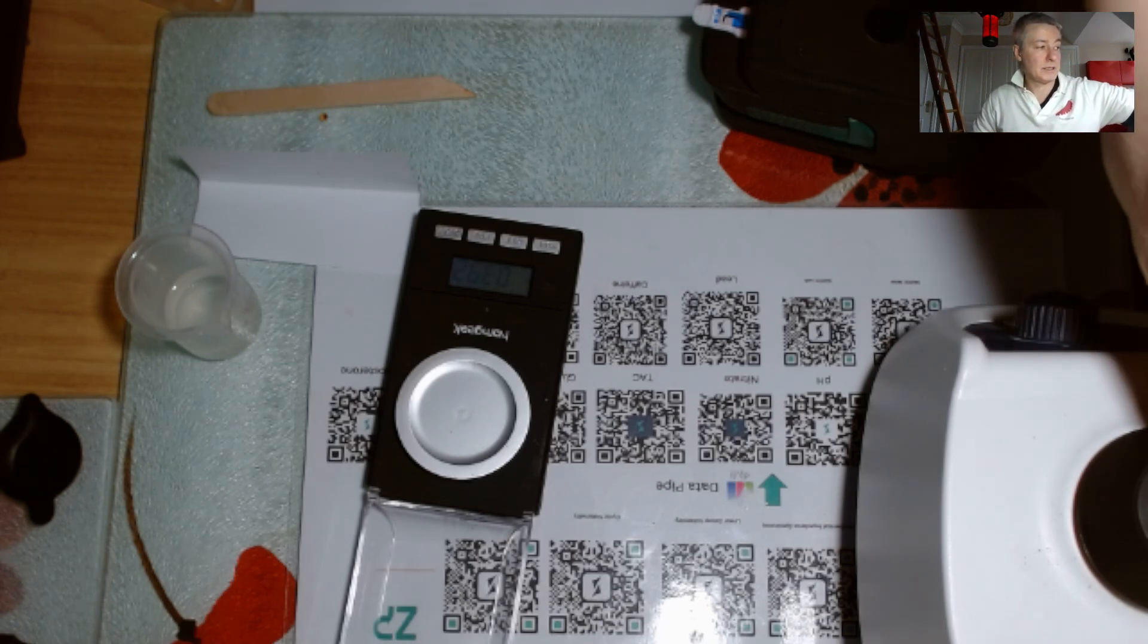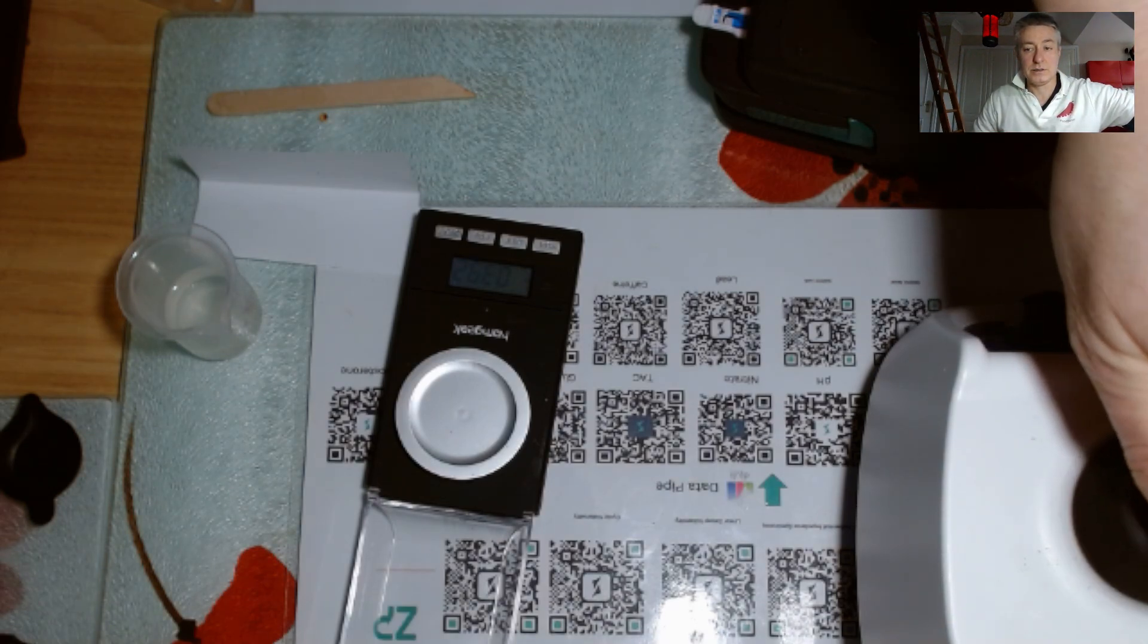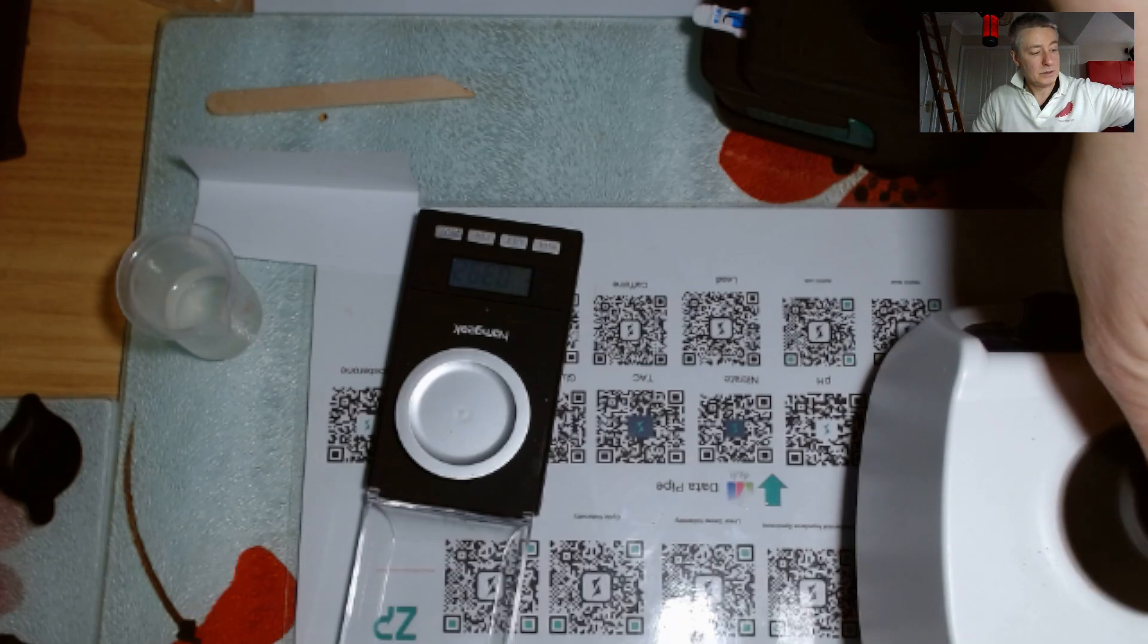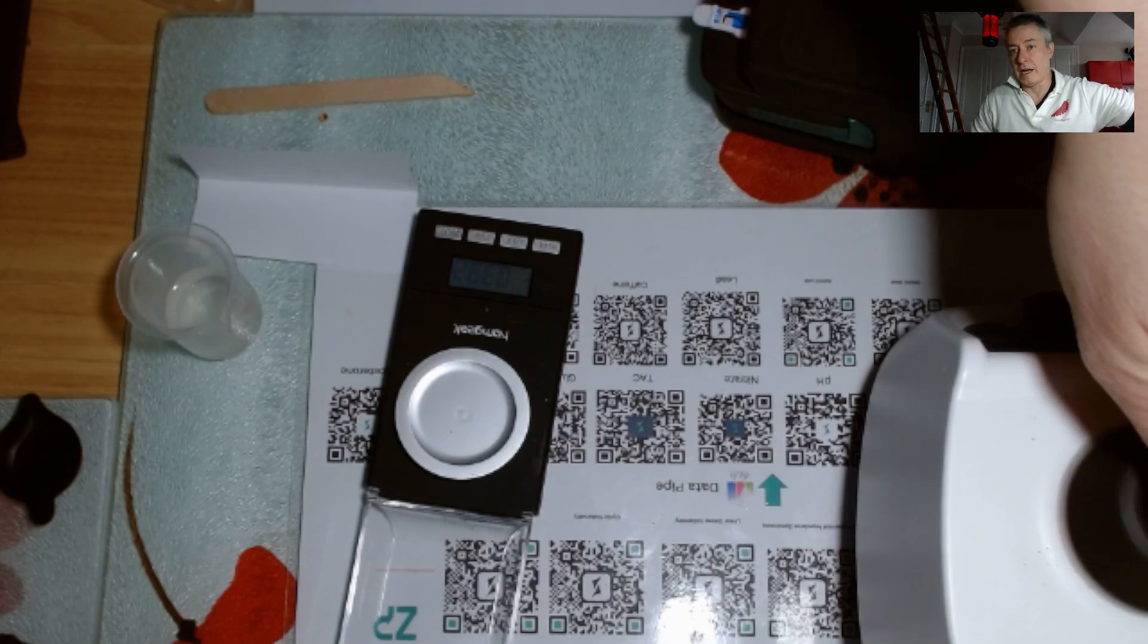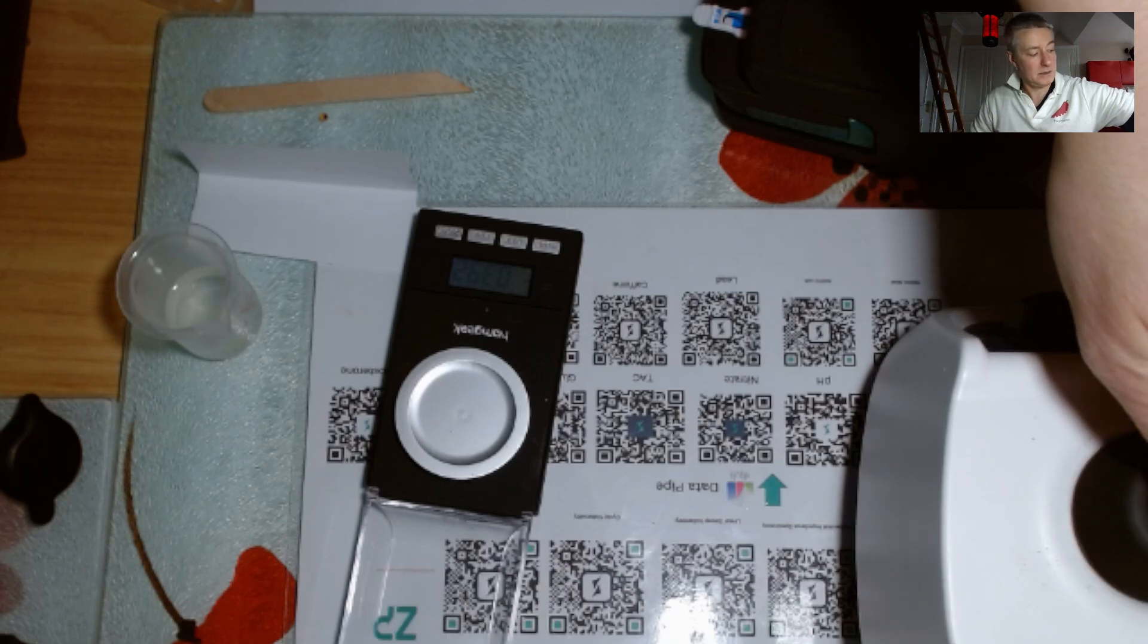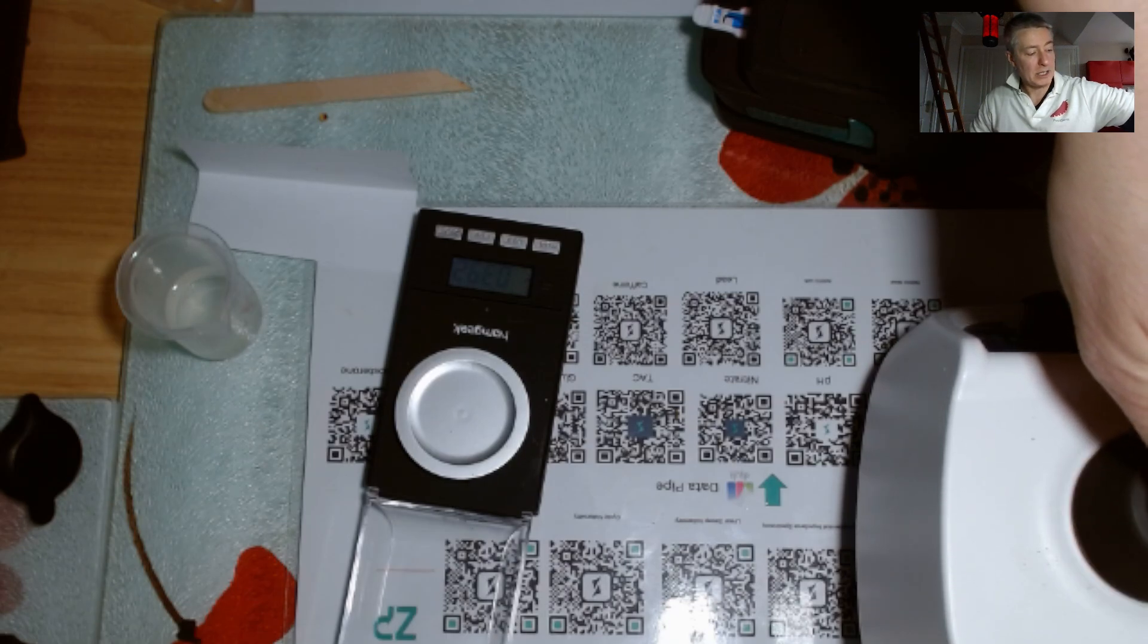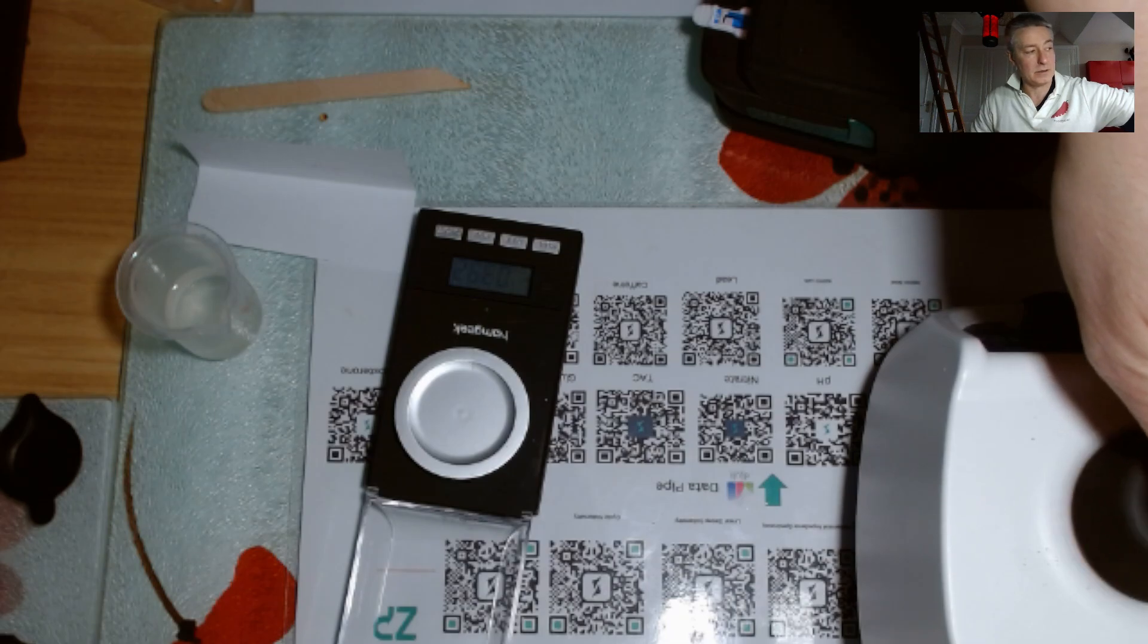Now I'm just going to vortex this up on my vortexer here, so you would never be able to shake this at the speeds that this vortexer is actually working at. So I might do this for about a minute.